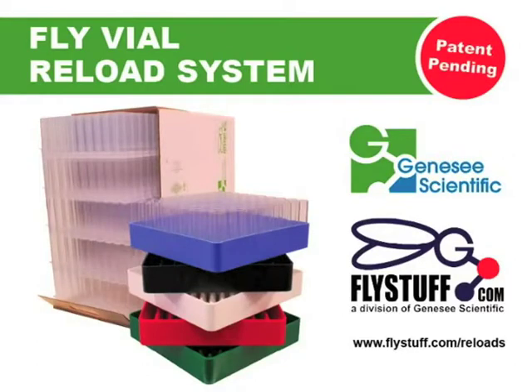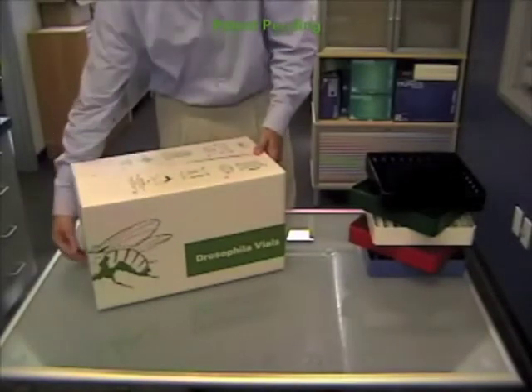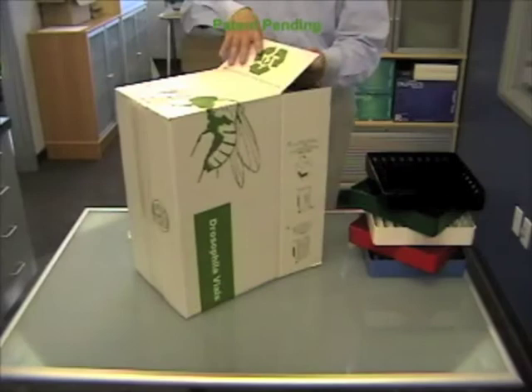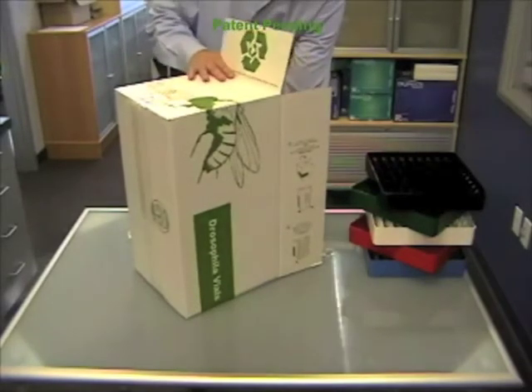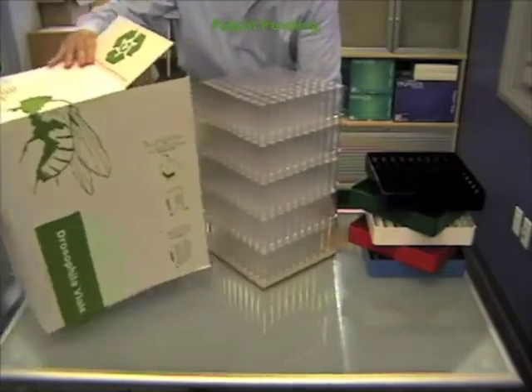Following are abridged instructions for use of the new fly vial reload system from Genesee Scientific. As you remove the tower vials from the unit box, there is no need to be gentle. The stack is structurally sound.